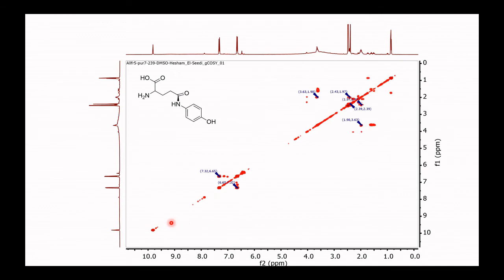group. We go to two-dimensional NMR, proton and proton spectra. And now you can see the correlation of the first two protons in the aliphatic region. And the next correlation on the aromatic. This is the AB spectrum. I think it is very clear that you have a square. So this two-dimensional is proof about each two adjacent carbons. If you couldn't see such a square, it means that these two protons cannot be adjacent to each other.